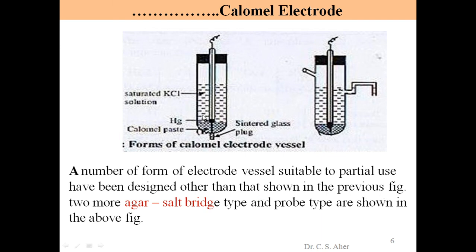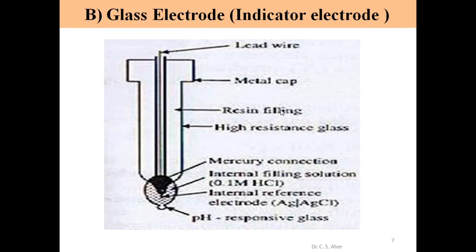So in the previous figure we had these two types of slide. Two more, an agar salt bridge type and a probe type, are shown in the above figure. These are two more examples. Vessels are changed but the connection is the same.